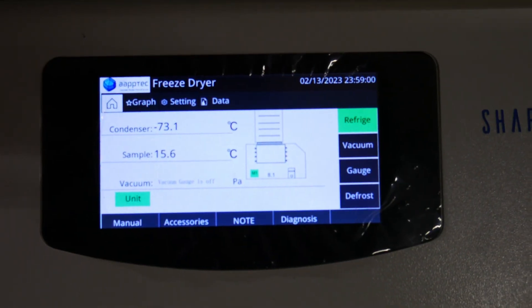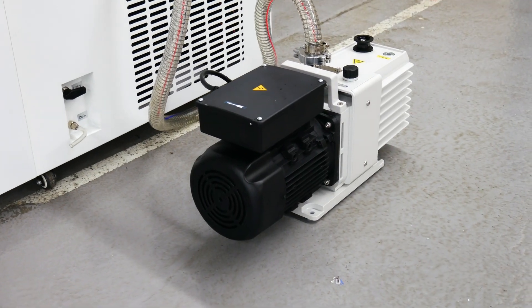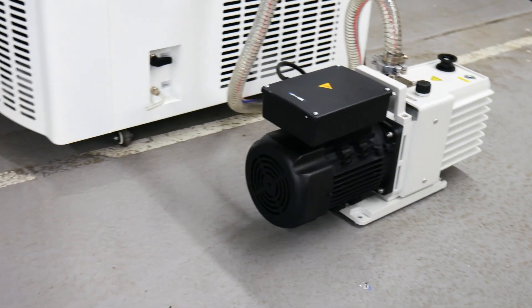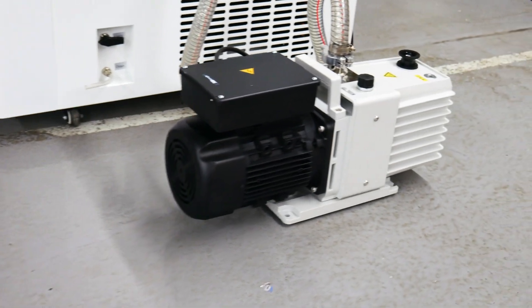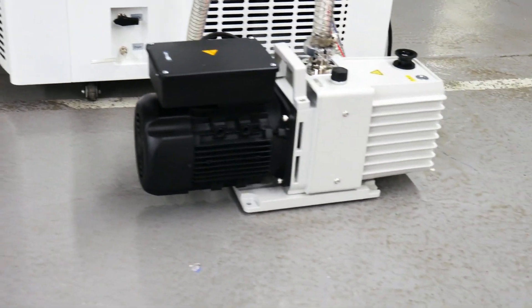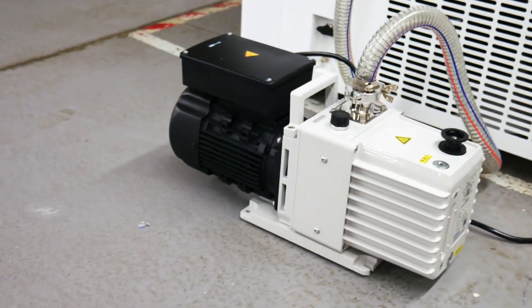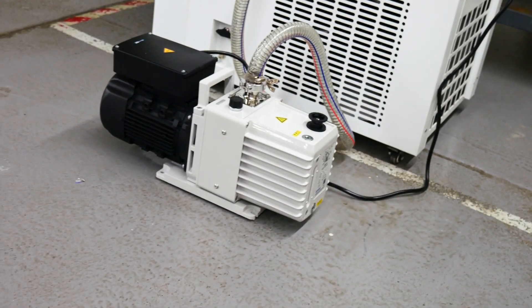In order to start the system, the vacuum pump needs to be connected to the system. Automatically, the vacuum pump will come on when the temperature reaches a certain minus-degree setting. When you turn the system off, the pump automatically shuts down as well. So, the system controls the pump.